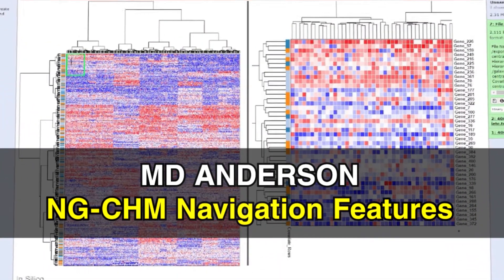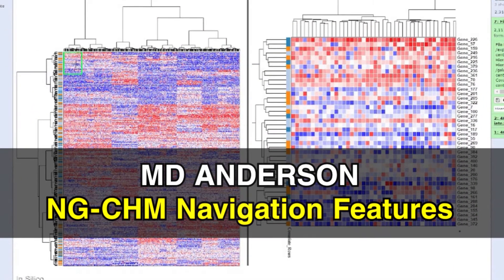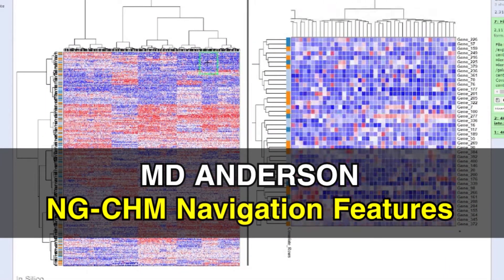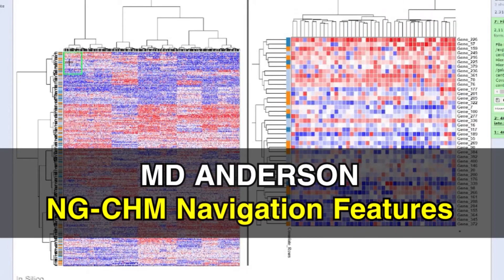In this video, we will cover the basic navigation features of MD Anderson's NGCHM Viewer.